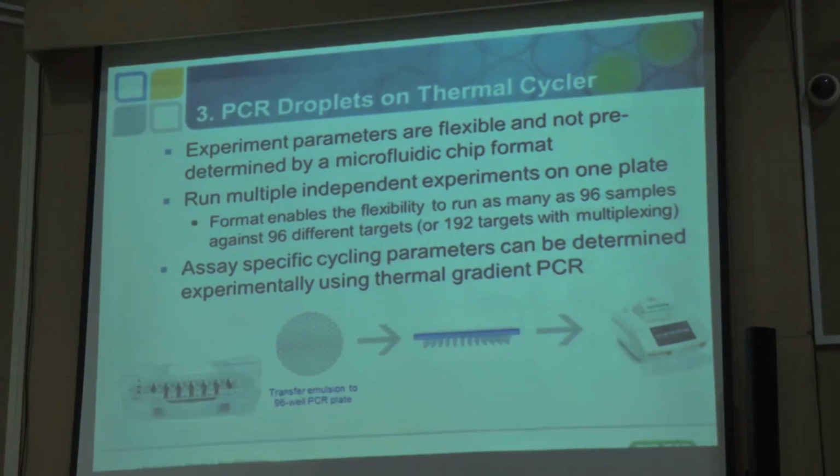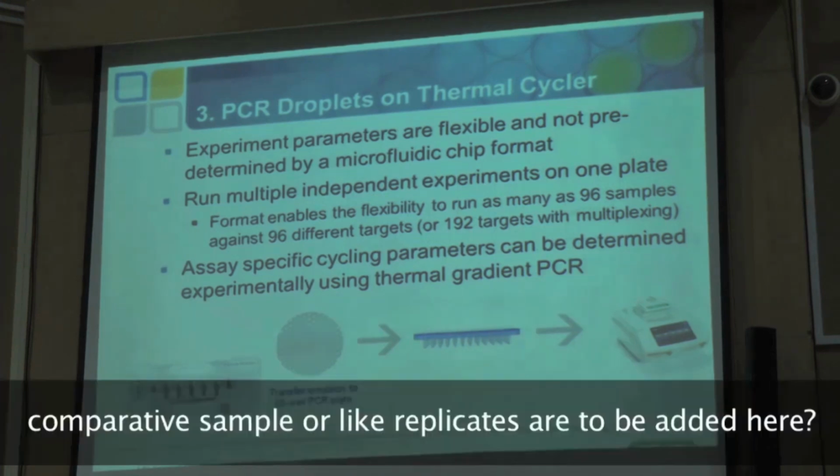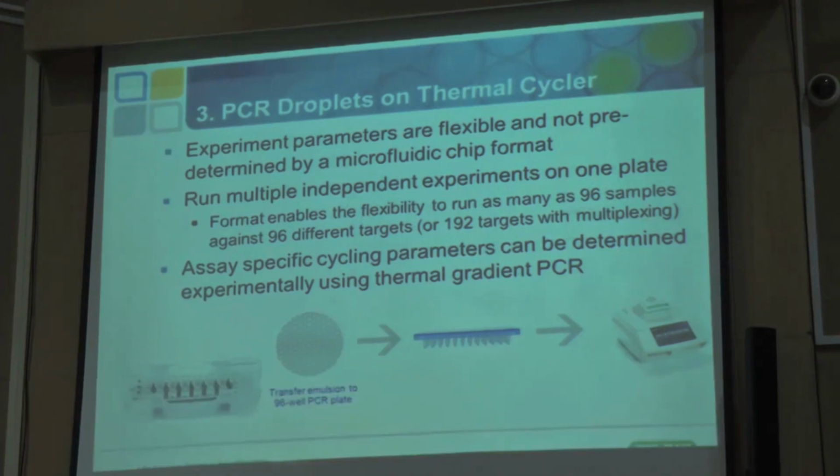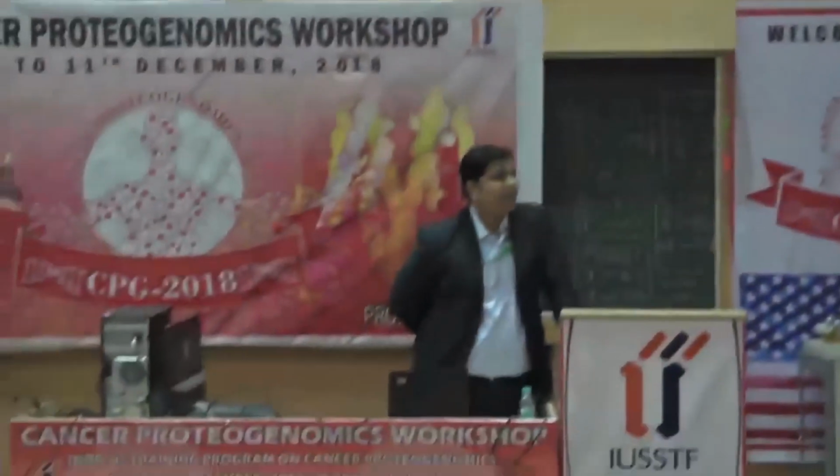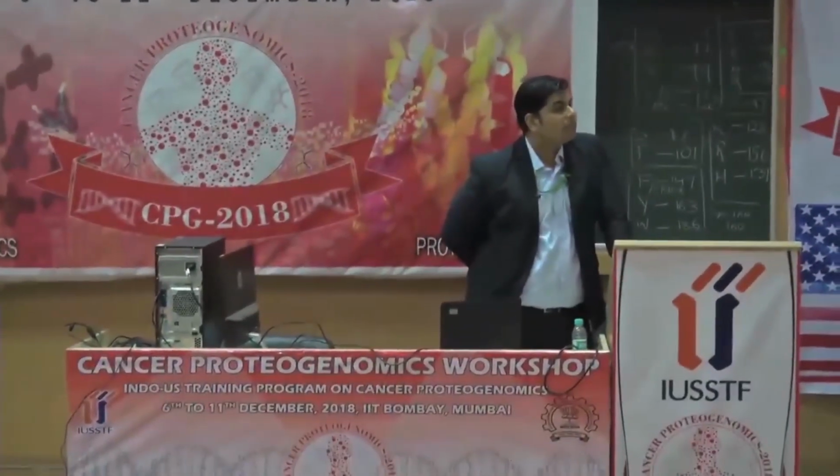The droplets which are formed are very stable. In fact, for statistical significance in other methods we need to do three controls and three treatments. You don't need that for this technology, because each of your reactions is split into 20,000 replicates. So you don't need technical or biological replicates like you do for real-time PCR.